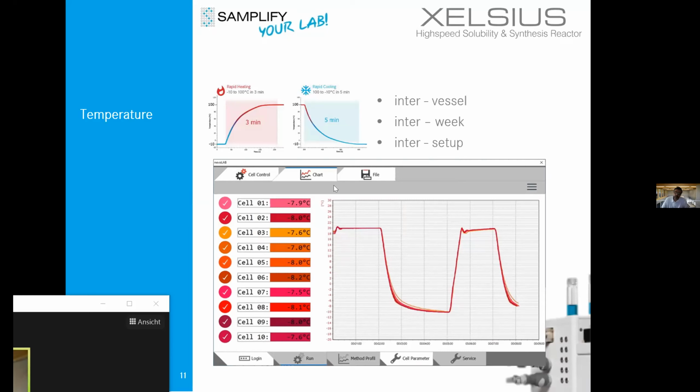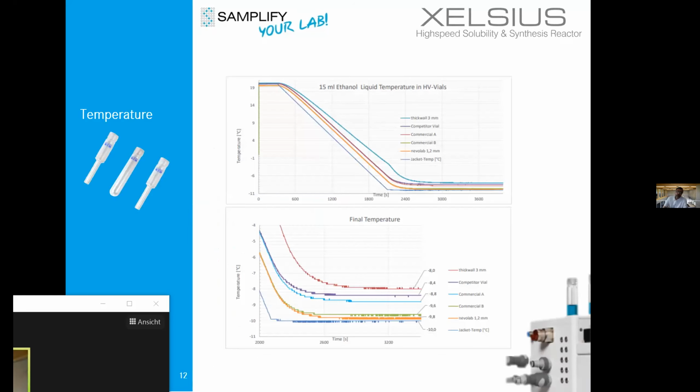performed. And also important is, when you compare different setups in terms of vessels or in terms of solvents, that these reaction setups will be comparable for reliable data. And here I will give you a small idea of the influence of the reaction vessel, and the dimensions and the tolerances and the wall thickness of the reaction vessels.